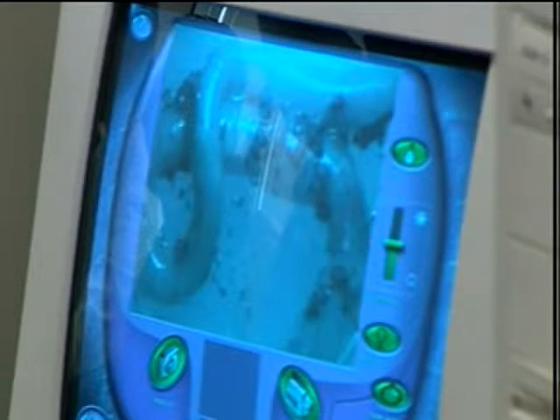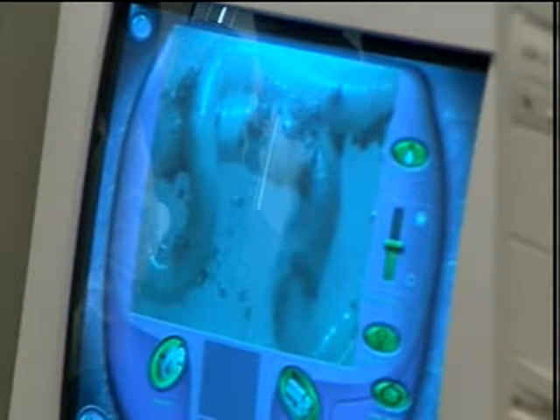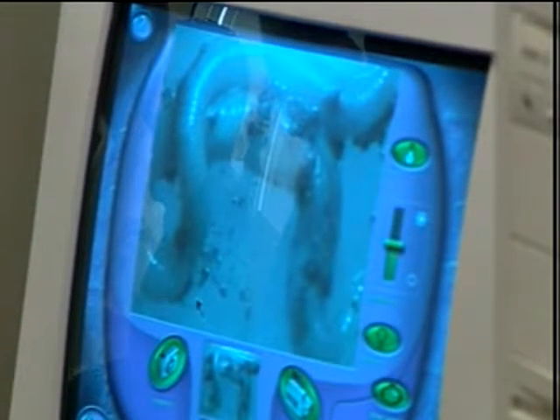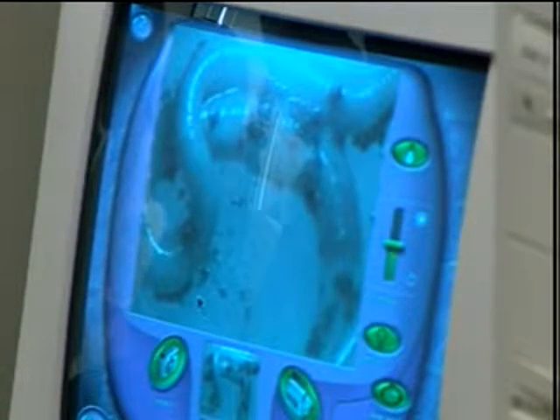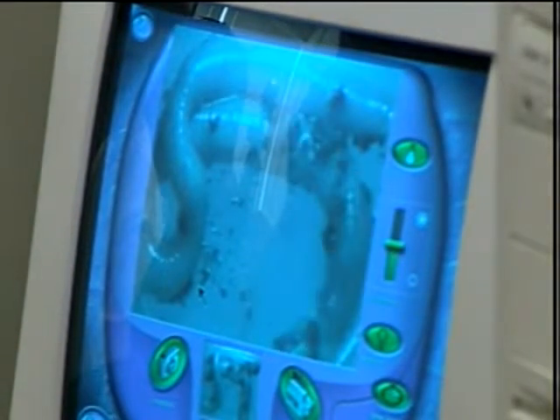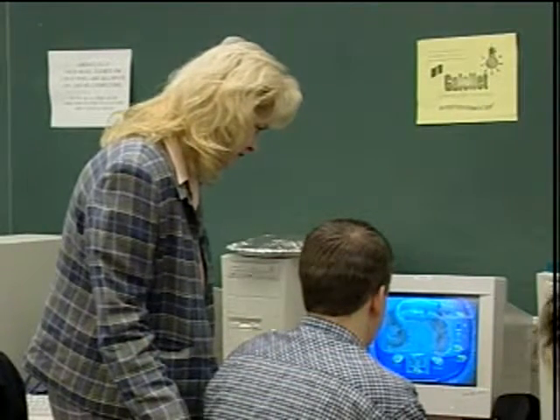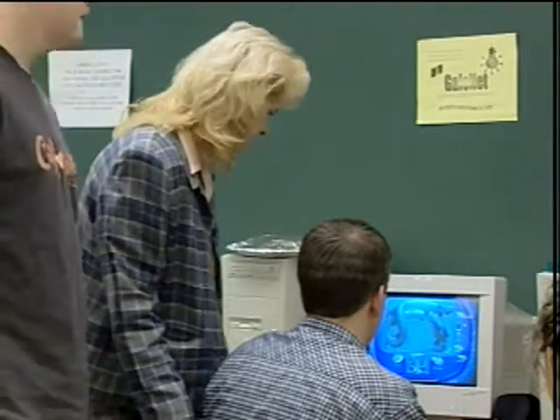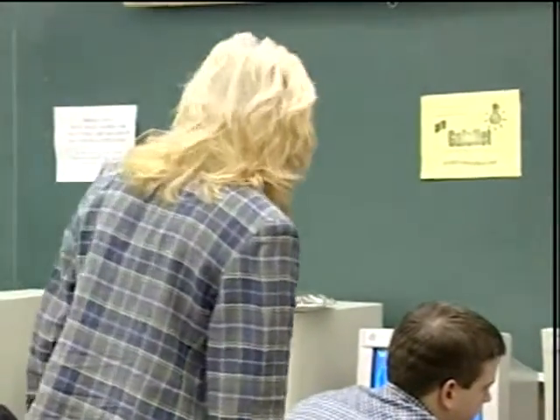Now, where did this worm come from? Sherry, Joe. Sherry dug it up? Yep. So it's an earthworm native to Southside, Virginia. And you can actually see the coloration of the blood as it flows through the vessels. That's very interesting. All right, let's see if you can find some other things to examine, or magnify it a little bit more and see what the surface looks like.